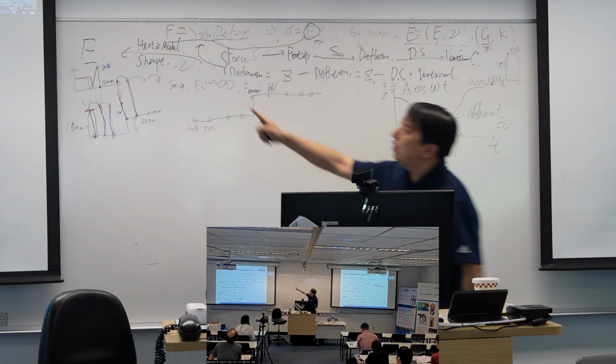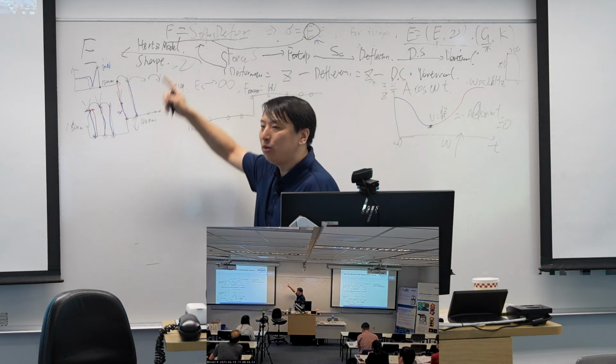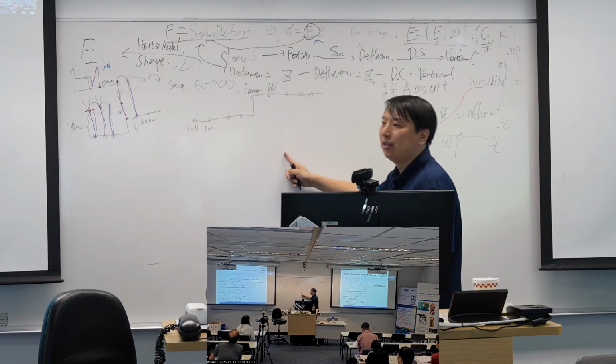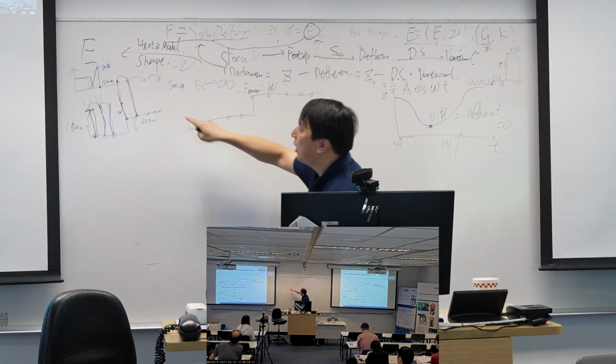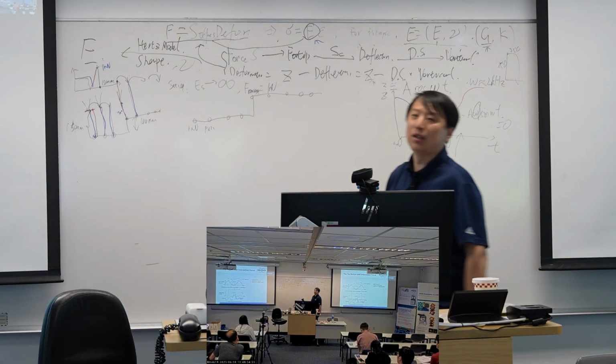I use the 1 nN force. I use the 100 nanometer setup. I do the force curve on each point. Once I finish one point, I jump a distance and do another one. I jump a distance, do another one.